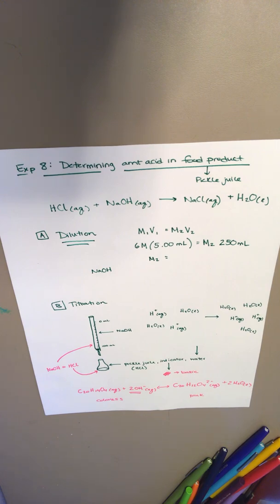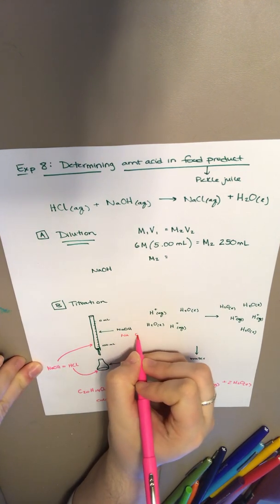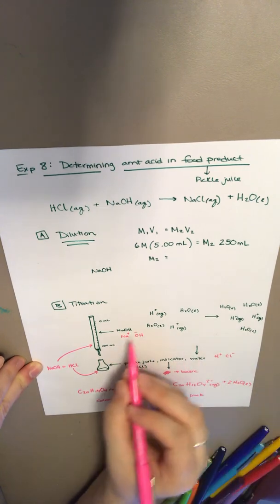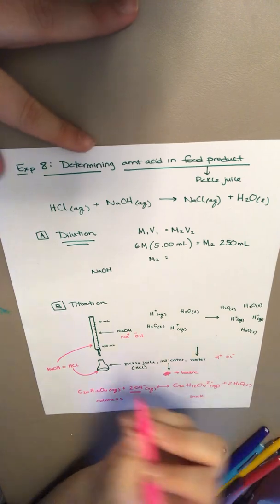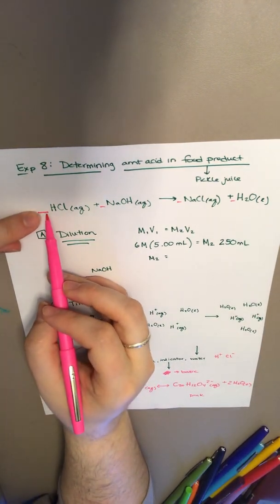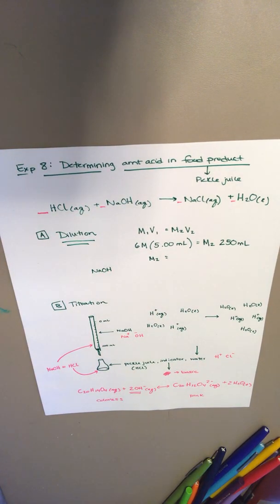We are looking for that equivalence point, when the moles of the acid equal the moles of the base. And because we are using Na plus OH minus and H plus Cl minus, we know that they're reacting at a 1-to-1 ratio. So this lab also pulls in stoichiometric ratios. In the calculation section, we'll be able to use a 1 molar ratio of our HCl to a 1 molar ratio of our NaOH to solve equations.